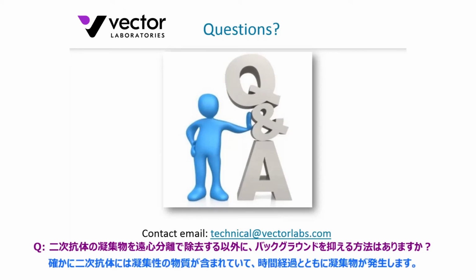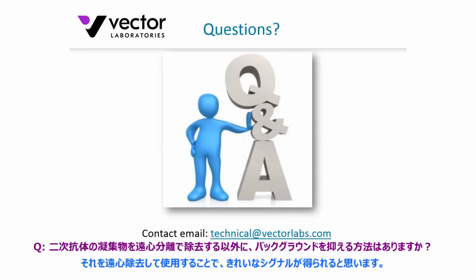Secondary antibodies may have some flocculent material in there. Maybe you might get aggregates over time as a concentrate that can be spun down to separate those out. And then when you do dilute it out, it might give you a cleaner signal. But if that doesn't, then you're going to have to do a series of defined deletion controls to identify whether or not there may be other segments of the detection methodology that are causing the background, or indeed the tissue itself may be autofluorescent. And go back and have a look at that.